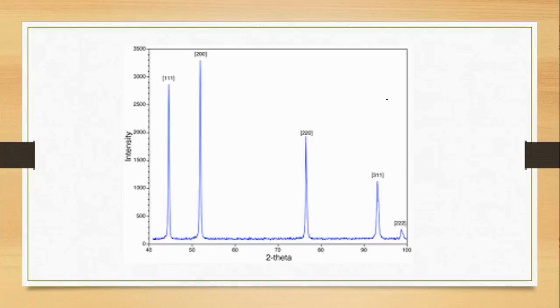How do you control for interference, i.e., noise in the spectrum? Okay, that's actually a good question. How do I take account of all the noise? I mean, there is some shielding, right? But I will have to double check this one. Texture. How do I understand? Do peaks vary or something? Yeah, peaks can vary.